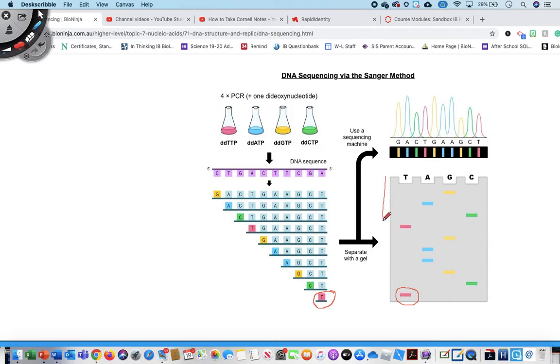So remember that the gel electrophoresis is going to run in this direction. DNA is going to be placed inside these wells here, right? And then this fragment here is going to be able to move very long distances towards the positive electrode here in the gel electrophoresis chamber. And then this fragment right here is somewhat medium length, right? So that's this fragment right here.